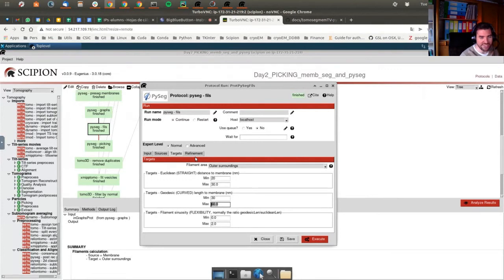Yeah, cool. Because I don't have these boxes at the bottom. Oh, okay. Yeah, if the graphs is still running, maybe it can take a little bit longer than usual to render the images. Okay, so with these values, we can refine it to make it faster, but you have from 0 the canonical ones here in the tutorial.